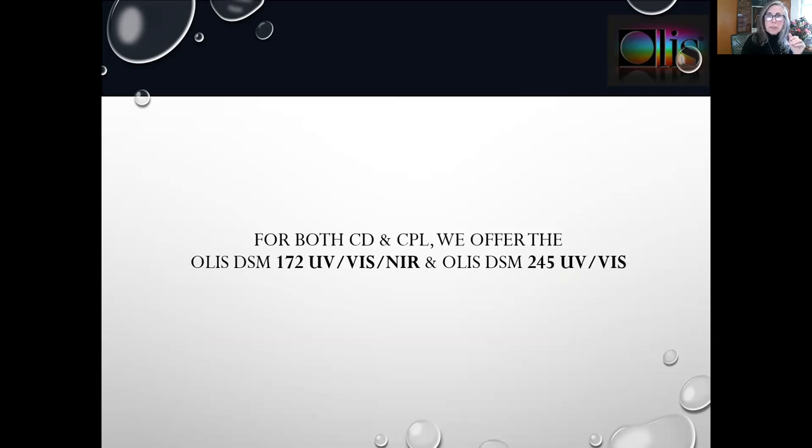Here is the polarization toolbox sample compartment with the lid off so we can see inside of it. For the CD-CPL combination instrument, you open it up to position the polarizer sensor before or after the sample, as well as the modulator before or after the sample. For both CD and CPL, we have two different instruments. The 172 supports not only ultraviolet visible but also near infrared, and for the ultraviolet visible alone we have the 245.